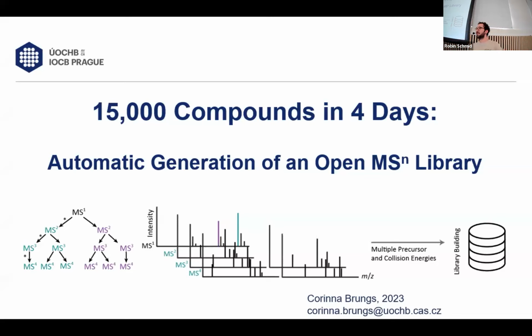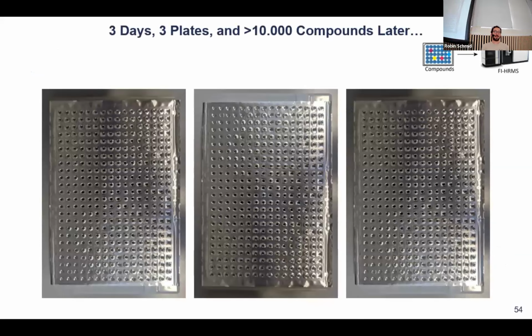But it's also important, like we buy some compound libraries, and now the struggle starts, you know? We want to measure those compounds, we want to directly extract the spectra and push them into a repository, but what is the standard way of doing that? There's MassBank, there's GNPS, so there are many different ways.